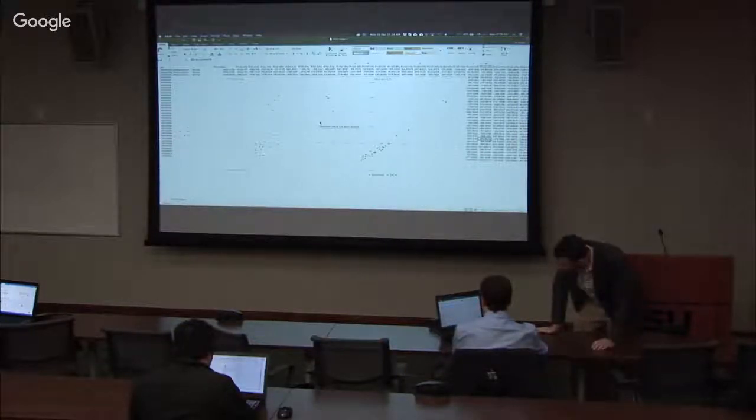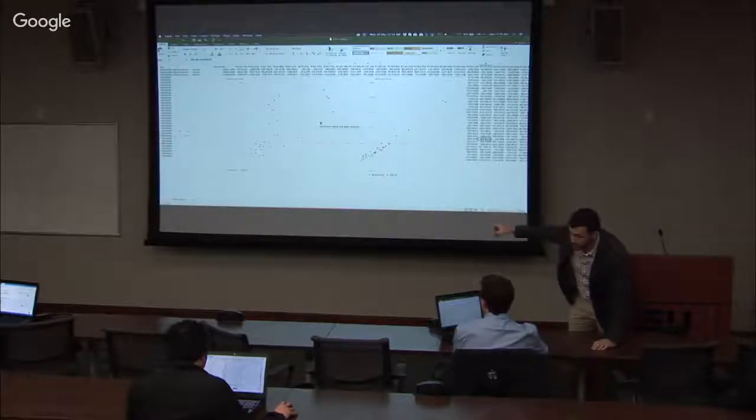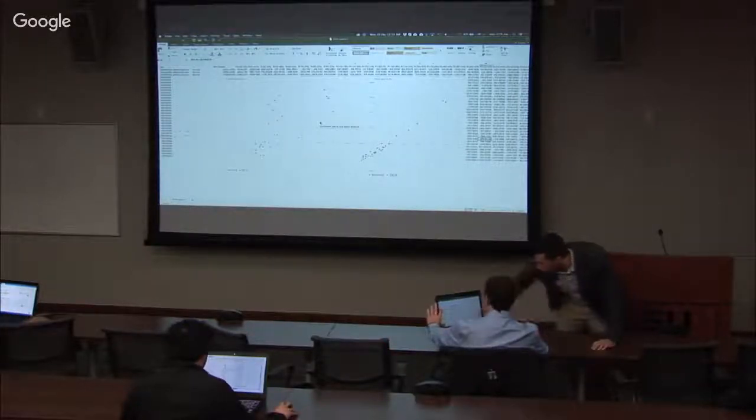Yep, this file. So it's kind of different from your one. It doesn't have PC1, PC2. Right. But it's the same thing because these values are also in the parentheses. You just know that it's PC1, PC2. And then you have a separate file which has a subclassification of these different genera. No, you see it says right there normal, and then there's subtypes.